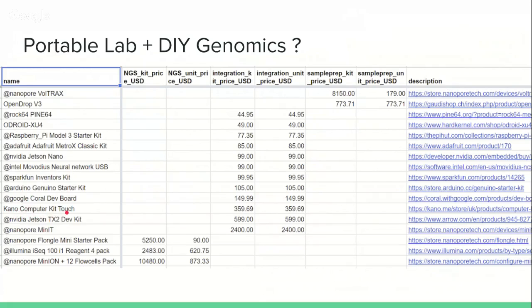These are quite cheap, as you can see, all of them, but it'll give you flexibility in tailoring or doing more bespoke computational rigs if you really know what you're doing. Obviously, this requires a deeper knowledge on not only the software but also the hardware and the electronics behind.